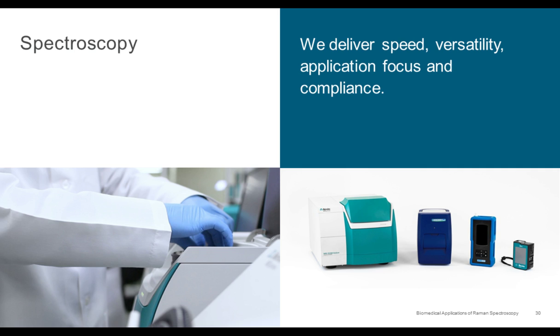That's because spectroscopy delivers speed, and the technique itself is versatile, and with a little bit of customization, such as with the SIRS work, you can really develop application-specific approaches. And then, of course, spectroscopy can be made compliant, which, if you are going to be in the medical space, you certainly have compliance issues that you must overcome when you're putting out a tool for the point of care.